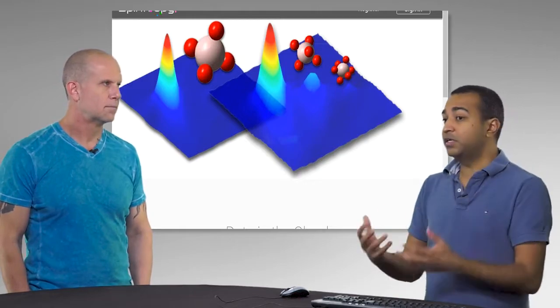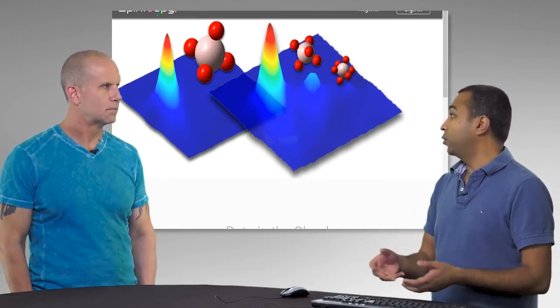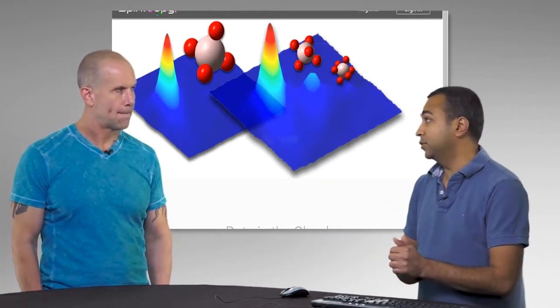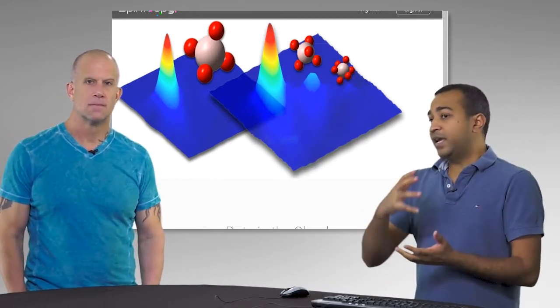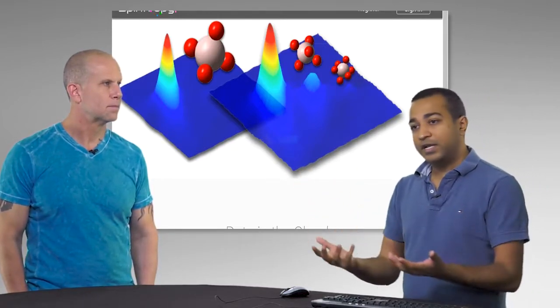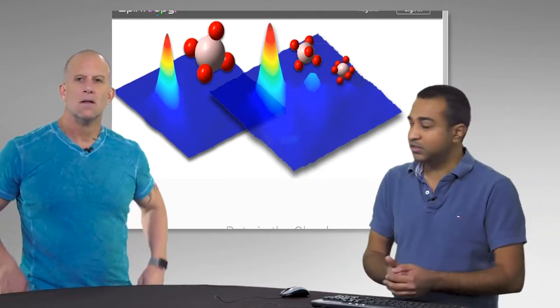And it's what really allows you to come into the facility, drop in a sample or a few samples, and then just leave. And you don't even have to come back to really see your data or pick up samples. But all the data then eventually goes online, and there's an ability to view the data here. You can download it, process it in whatever your favorite processing software is.